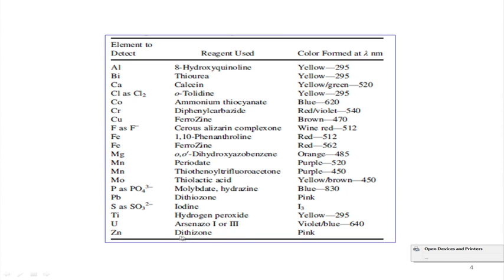Then another example is zinc, which is not colored, a colorless solution in the medium, and dithizone is again a nitrogen and sulfur based reagent. So, these are all very good ligands. These ligands, which can bind the zinc center, can also be used for lead.